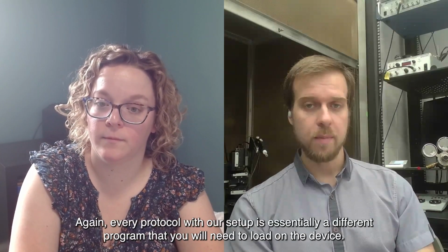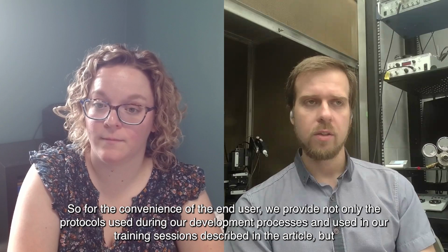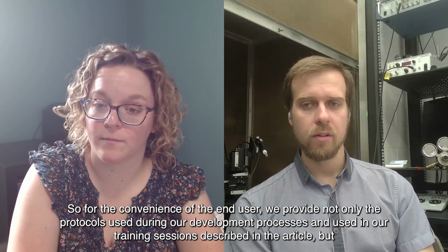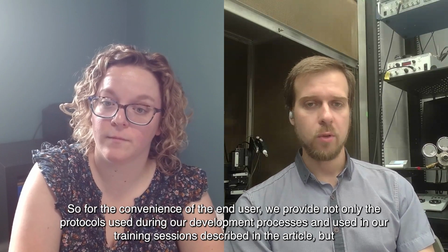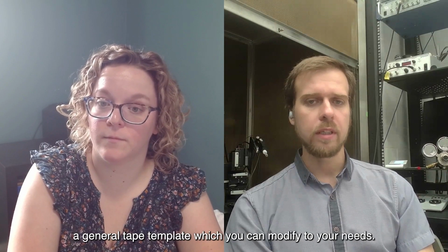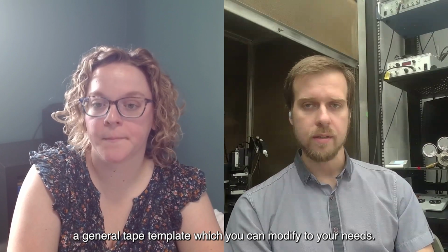And again, every protocol with our setup is essentially a different program that you will need to load on the device. So for the convenience of the end user, we provide not only the protocols used during our development process and in our training sessions described in the article, but a general template which you can modify to your needs.